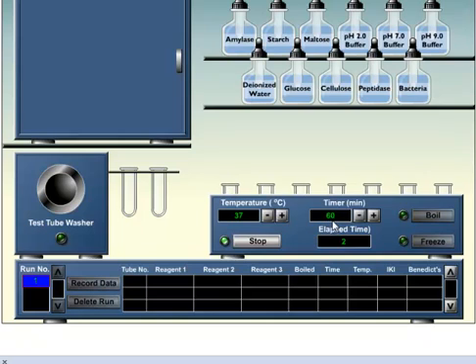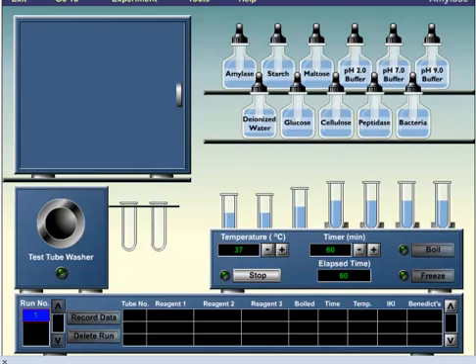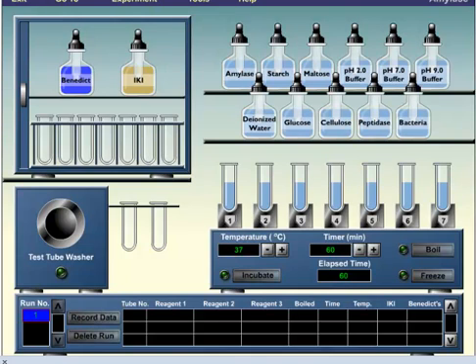Now suppose this incubation is one hour. This indicates that after one hour of conducting this experiment in actual lab, what would I get? This is the time lapse showing you 13 minutes passed, 16 minutes passed. After 60 minutes, the tubes have been incubated at 37 degrees for one hour. You could change the temperature if you want to.